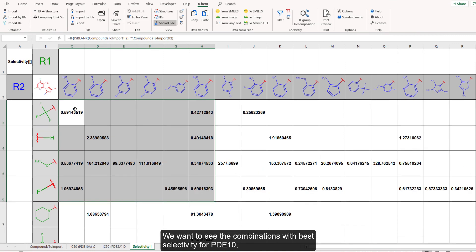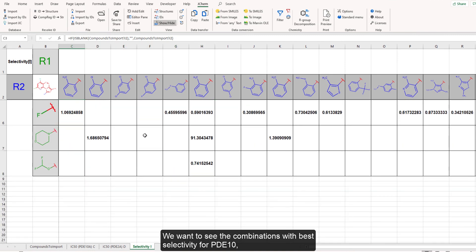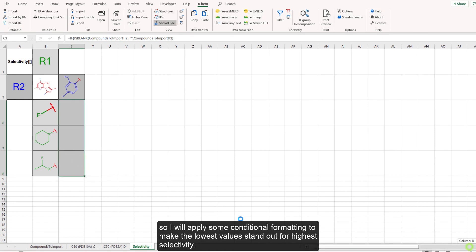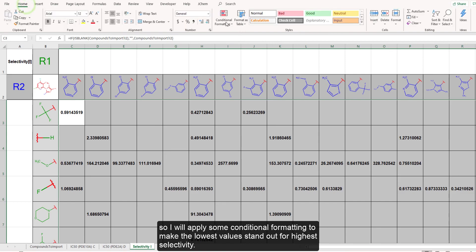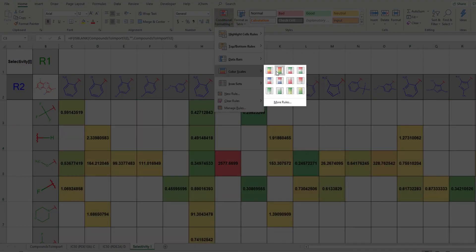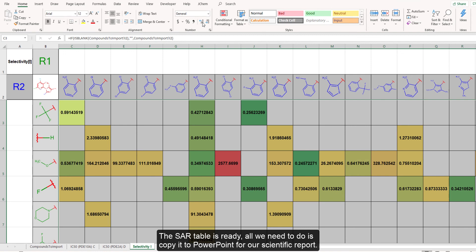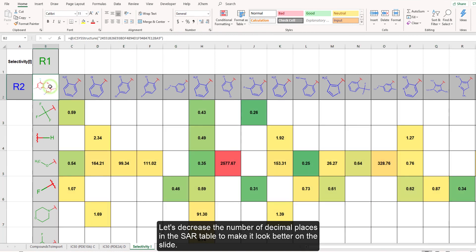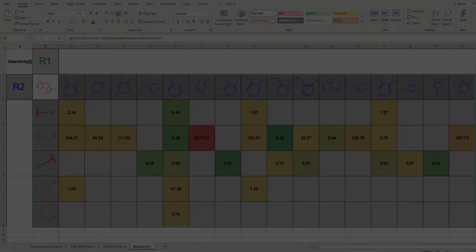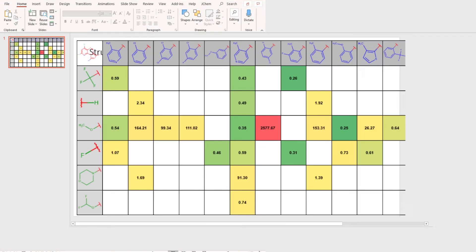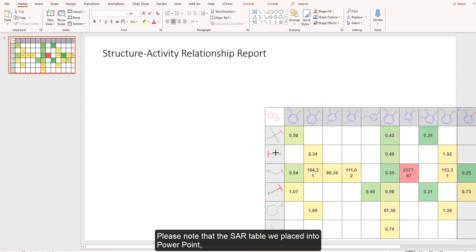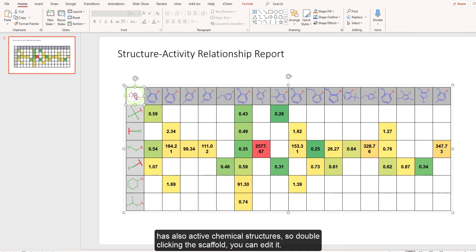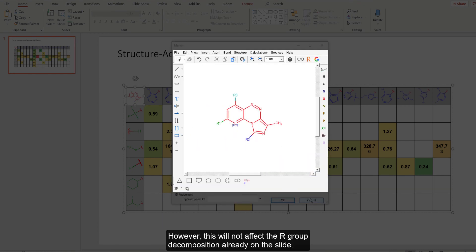We want to see the combination with best selectivity for PDE10, so I will apply some conditional formatting to make the lowest values stand out for highest selectivity. The SAR table is ready. All we need to do is copy it to PowerPoint for our scientific report. Let's decrease the number of decimal places in the SAR table to make it look better on the slide. Note that the SAR table pasted into PowerPoint also has active chemical structures, so by double clicking the scaffold you can edit it. However, this will not affect the R group decomposition already on the slide.